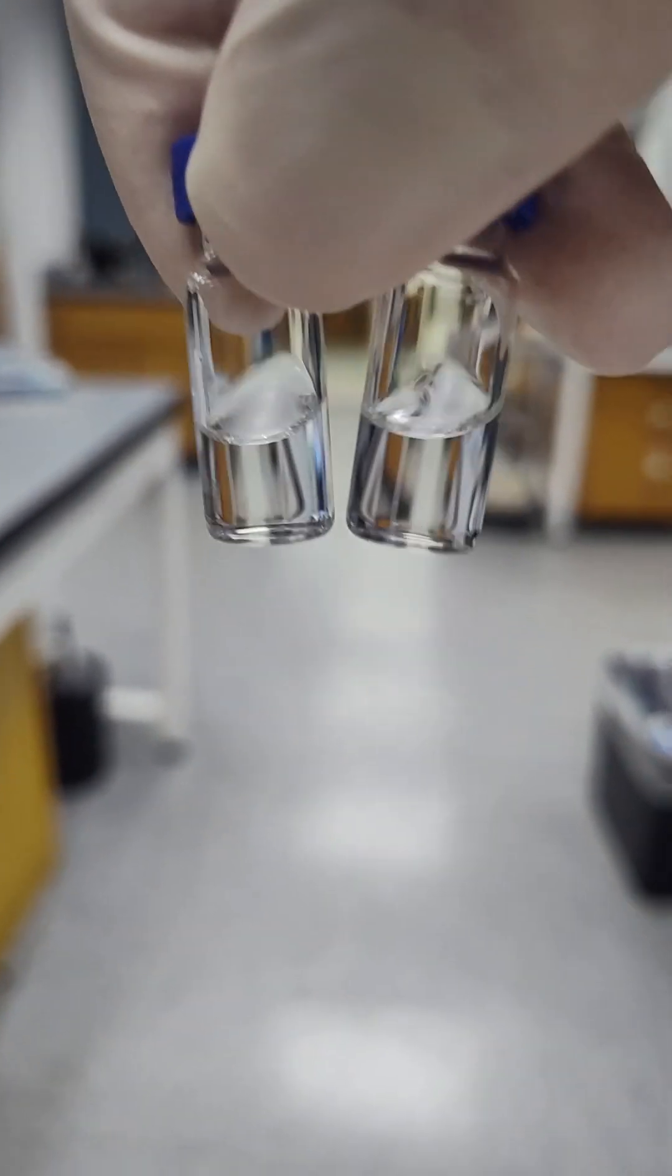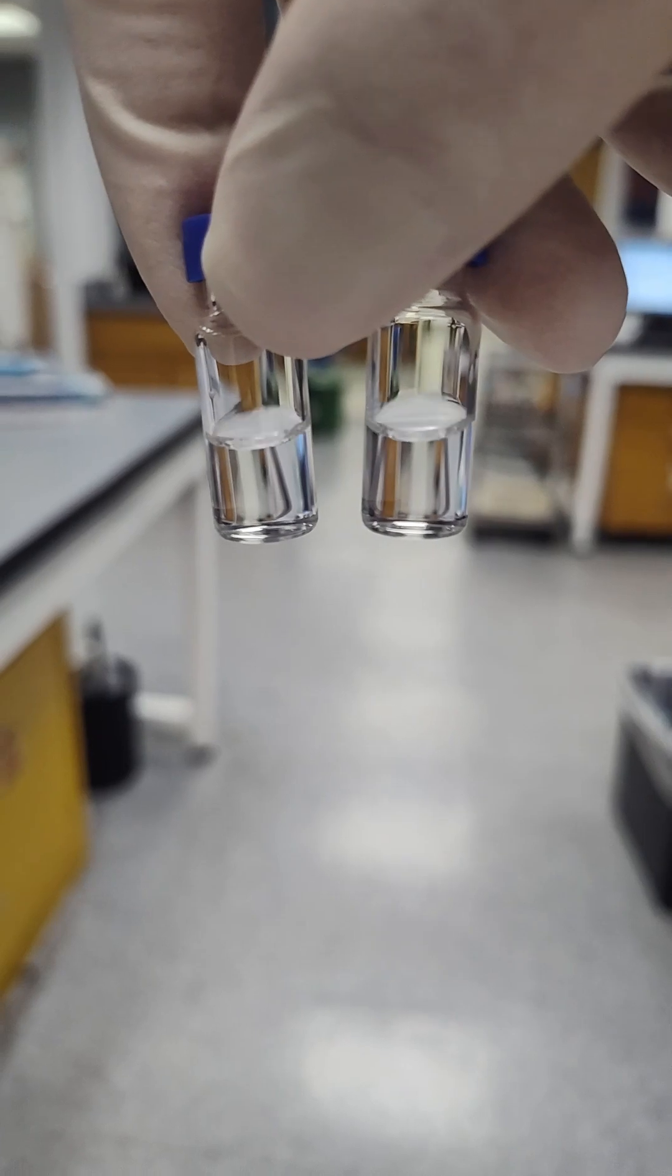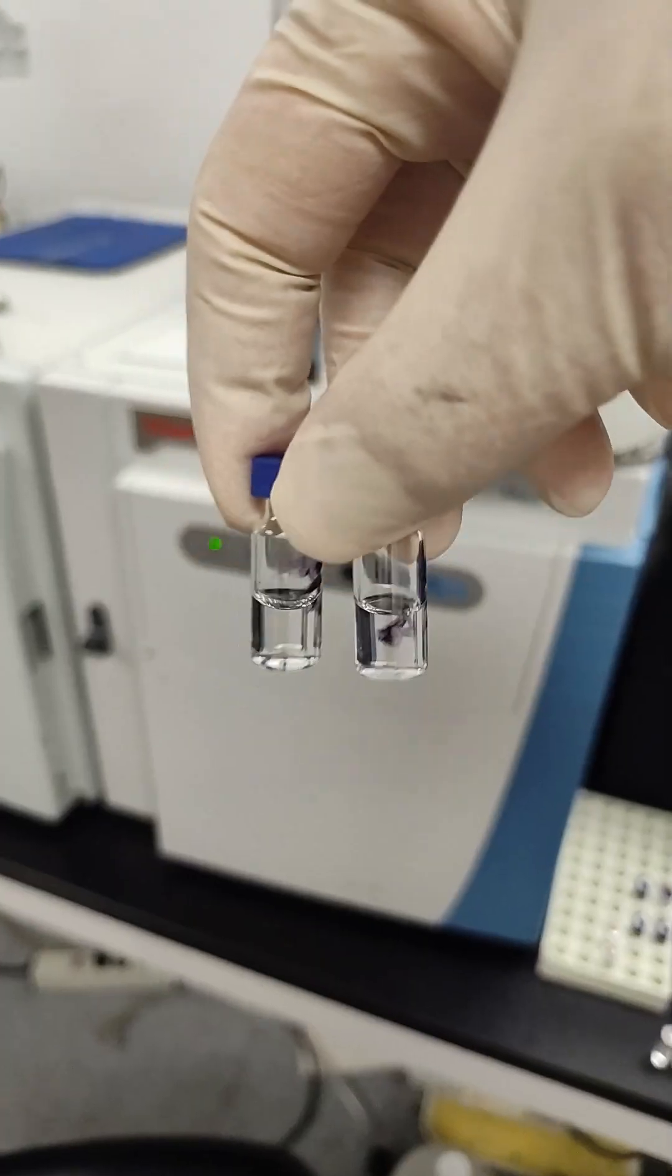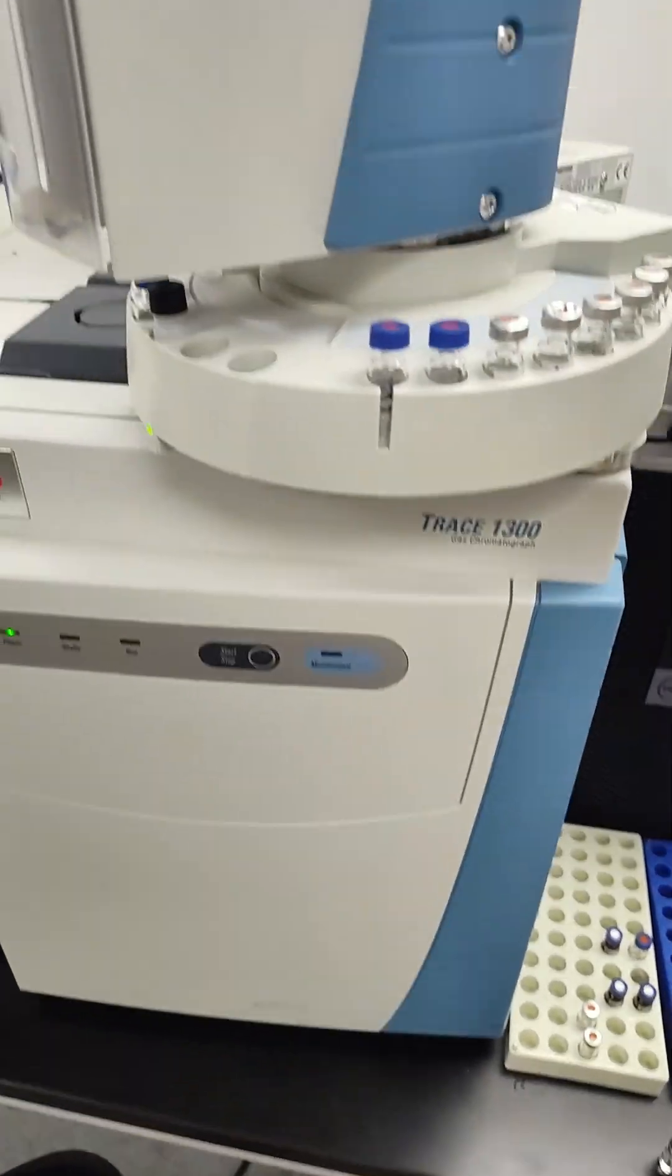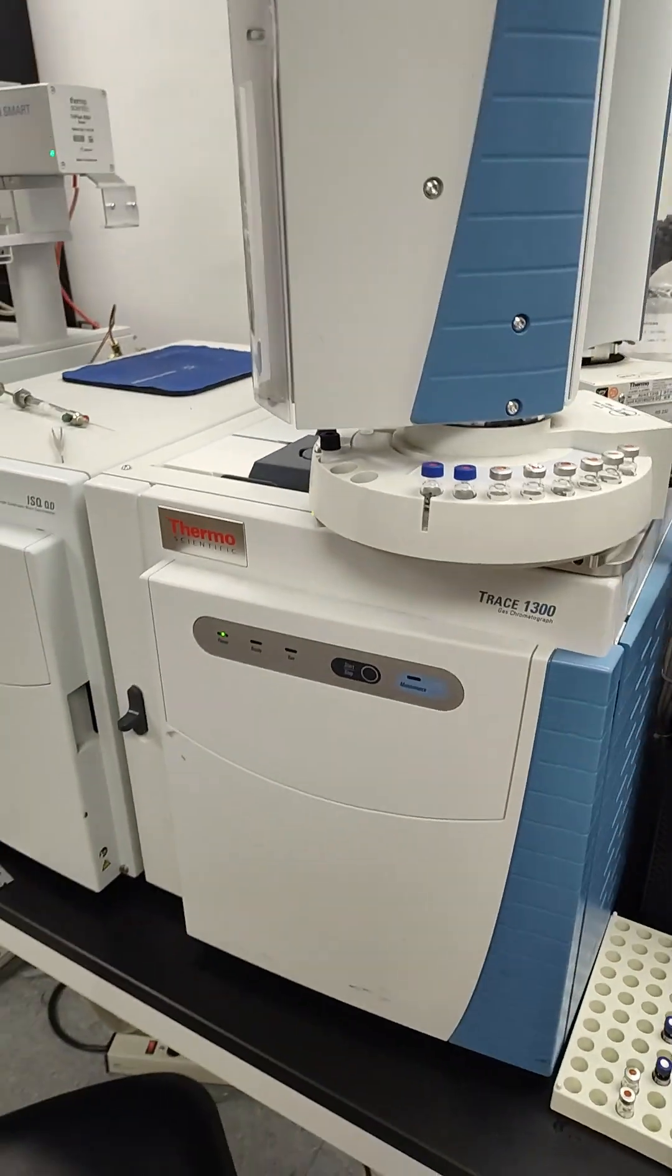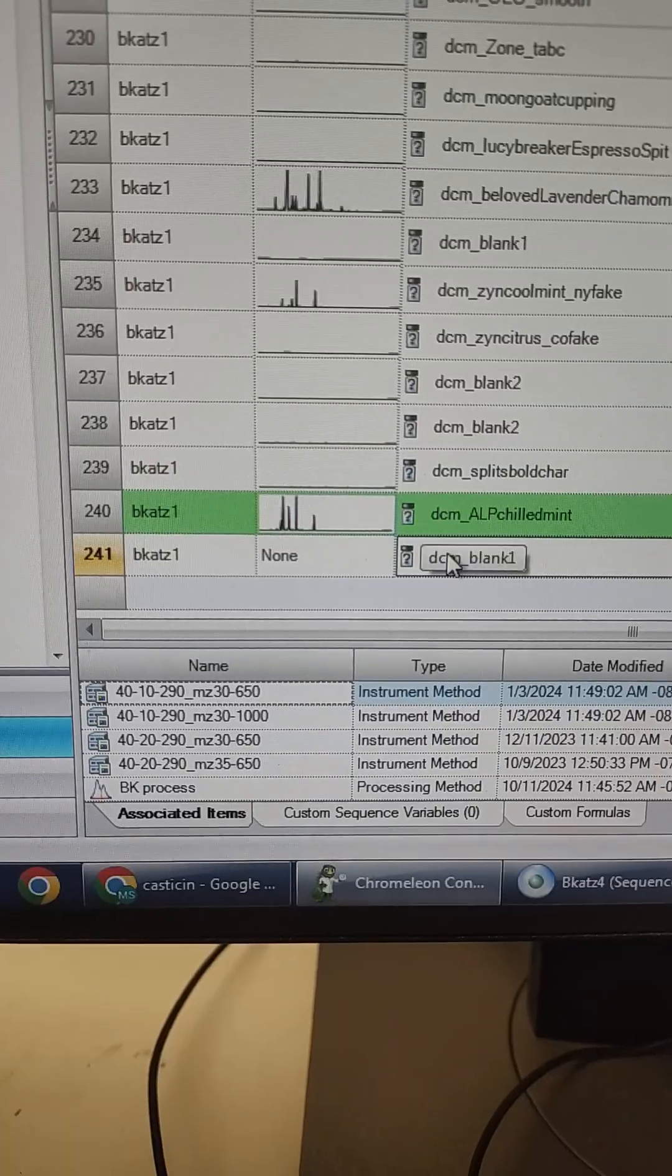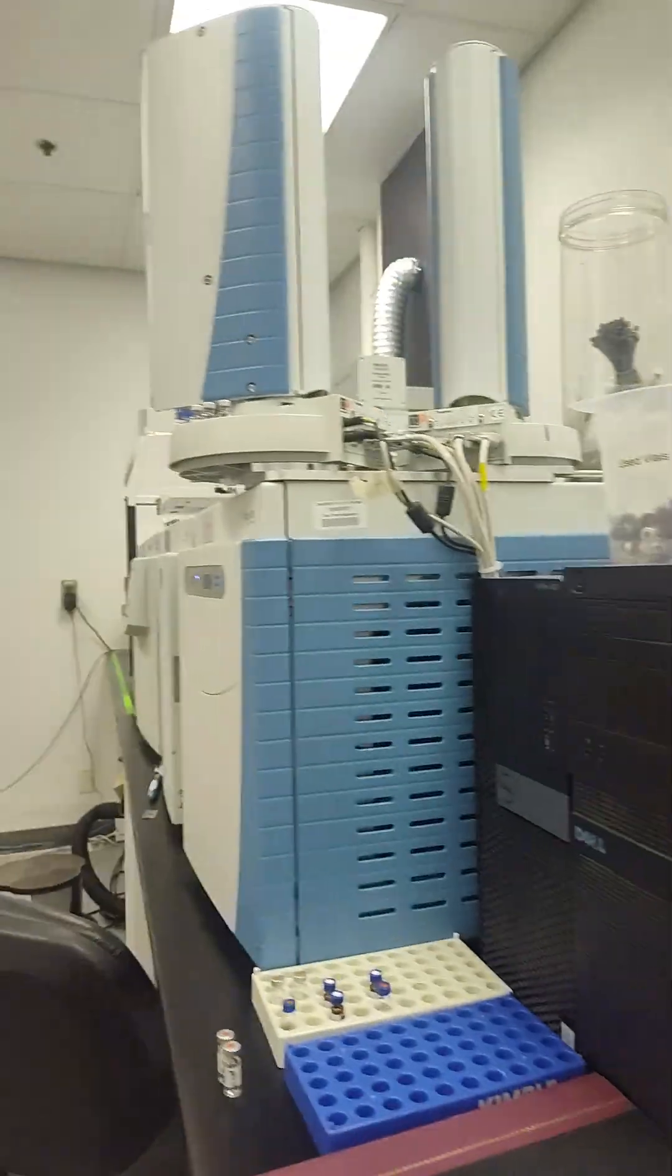Nice clean pull, good dilution, no floaties, ready for GC-MS analysis. All right, in the GC room we got the ALP chilled mint on the Thermo Trace. Let's see what's in this thing.